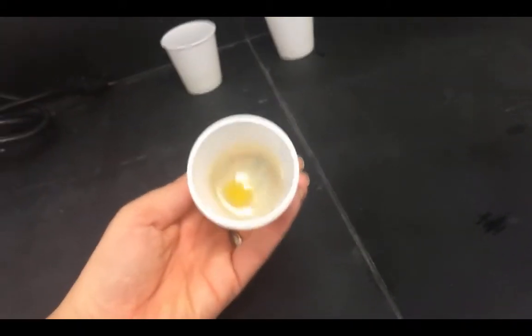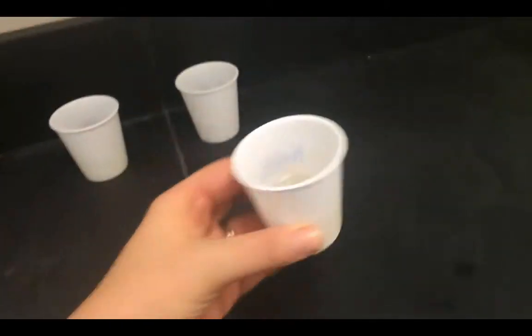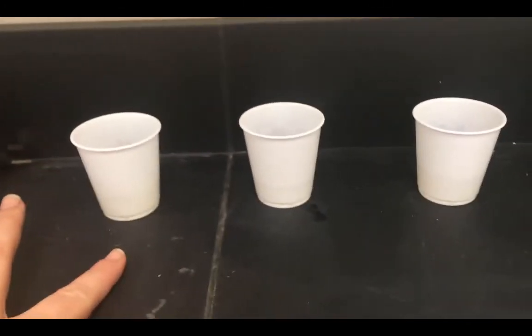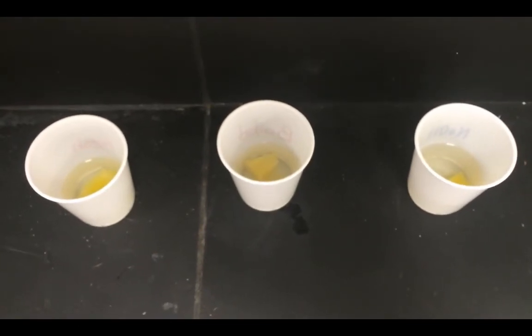So we can see here that the results are: the gelatin substance is liquid in the fresh pineapple cup, in the boiled pineapple cup the substance is solid, and in the NaOH-soaked pineapple cup the substance is also solid. So there you have it — there are your results. Enjoy. Bye.